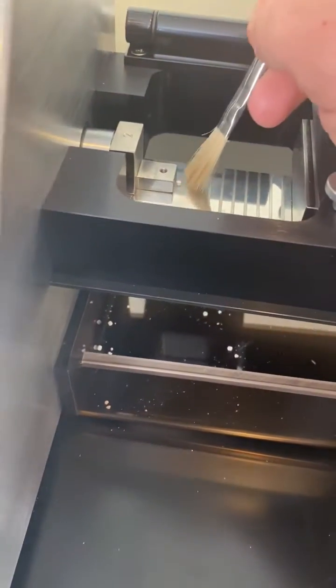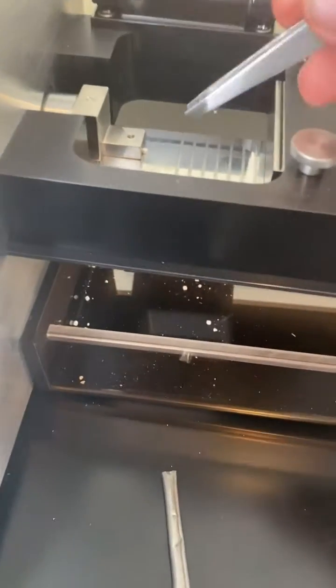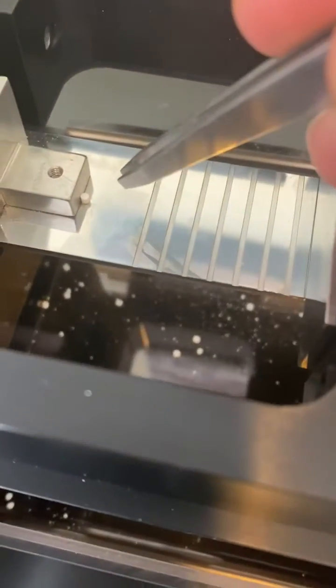We have tweaked out our load cell in order to be able to detect the break force limit on these. So we're using tweezers to actually align the tablet here.